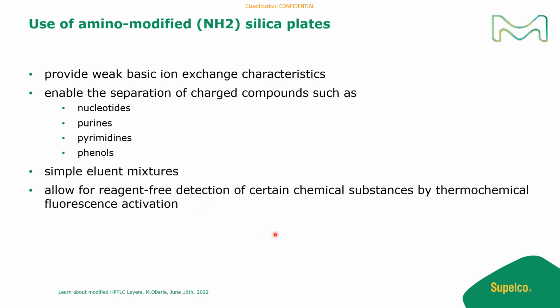And one very big advantage of this layer is that you can use it for reagent-free detection. Especially for sugars, you only have to heat up the plate, and the sugars react with the layer and are detectable under UV light, or you can see them by a brownish or yellowish color.